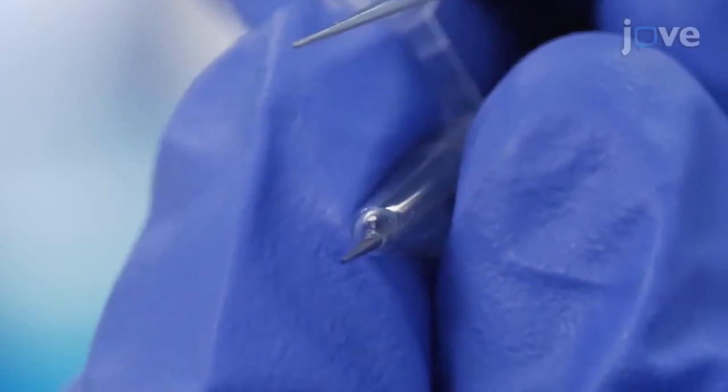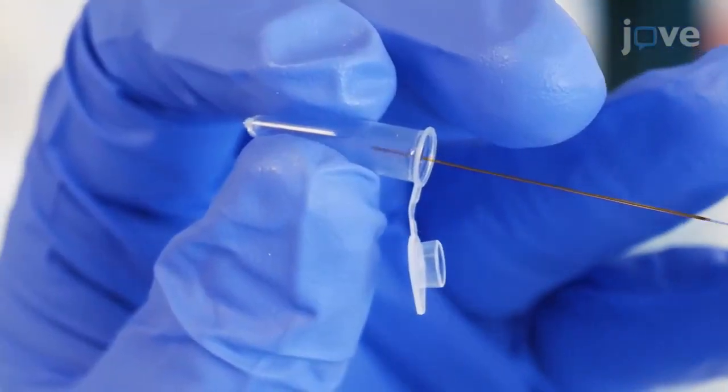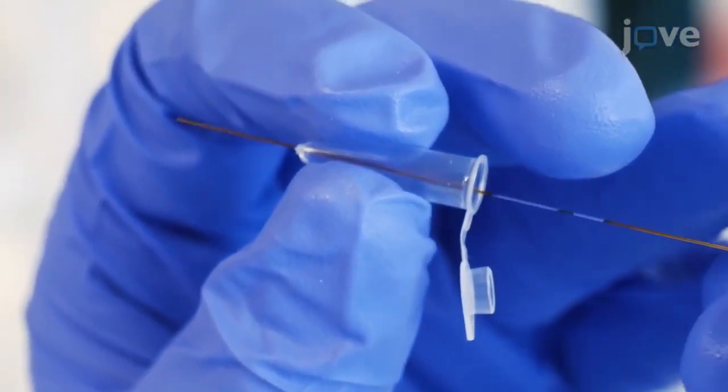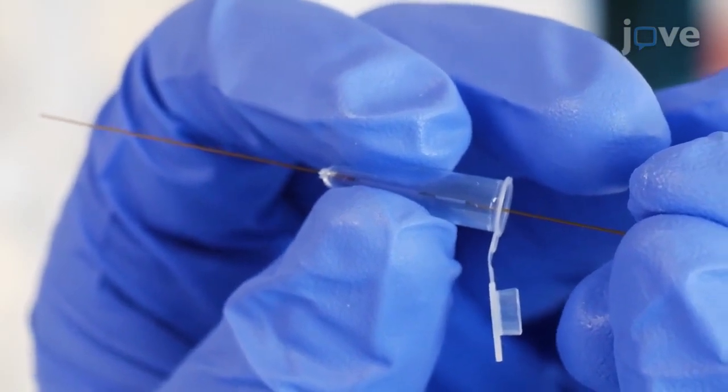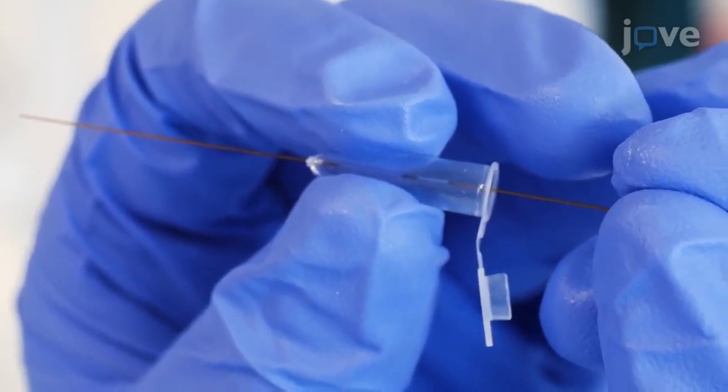Drill a small hole at the end of a 200 microliter tube around the same size as the capillary outer diameter to sufficiently hold the capillary in place once it is threaded through this hole. Thread the end of the capillary that is close to the burnt portion through the hole until the burnt portion is in the tube.